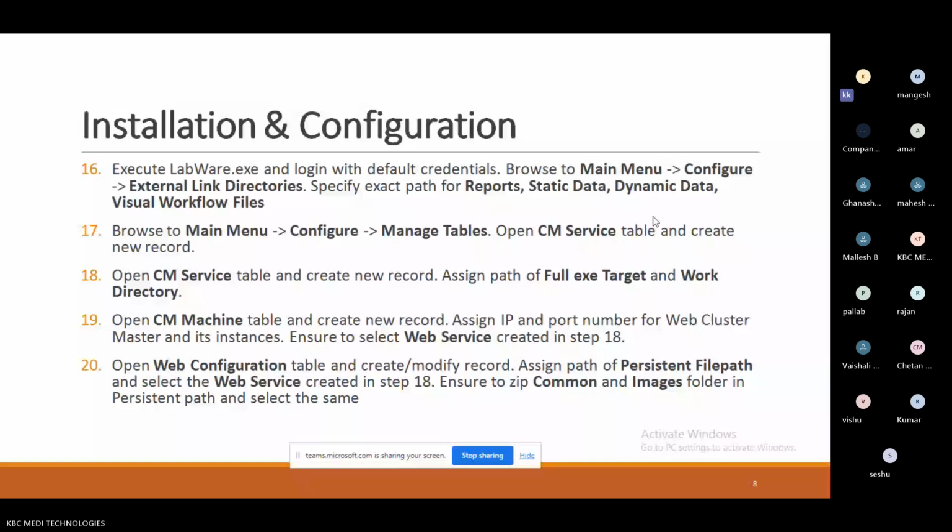At that time, the system is going to log the samples within fractions of seconds, for multiple instruments. Out of 100 instruments, today you have 10 instruments with daily calibration, 5 instruments with weekly calibration, 10 instruments with monthly calibration, 2 instruments with yearly calibration. When the day reaches, based on our scheduler login time, the system is going to log the samples automatically. In such a way, we can configure it in the LIMS system.